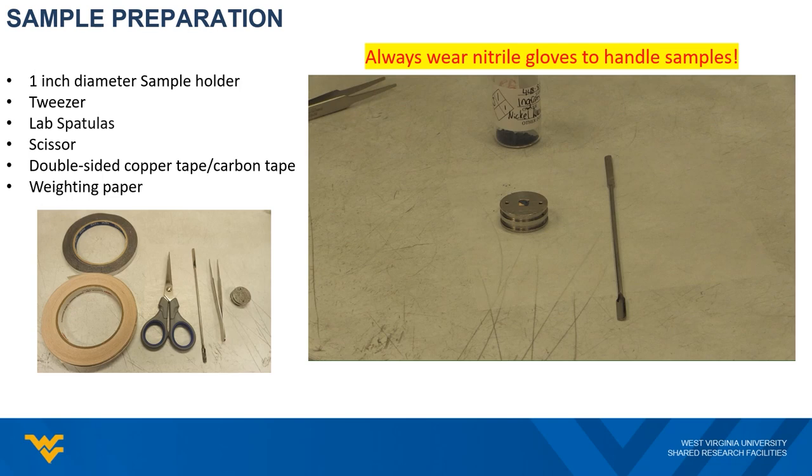You could also prepare multiple samples on a single holder, though you will need to avoid cross-contamination between samples during the preparation. For a film or bulk sample, you just need to tape your sample firmly onto the holder using the double-sided tape.